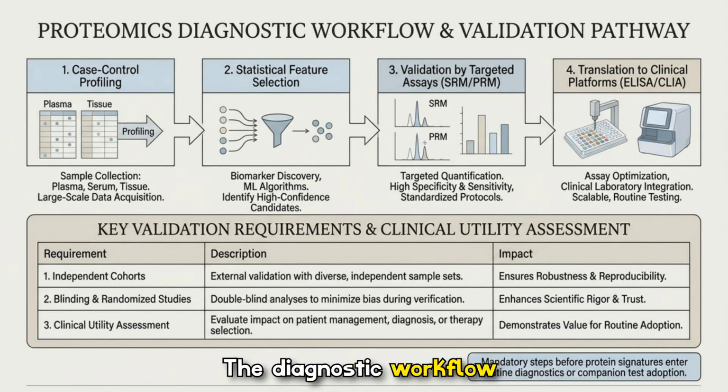The diagnostic workflow captures the path from case control profiling through statistical feature selection to targeted validation and clinical translation. It outlines large-scale sample acquisition, biomarker discovery with ML, confirmation by SRM or PRM, and assay transfer to ELISA or CLIA platforms, stressing independent cohorts, blinding and clinical utility assessment for robust adoption.